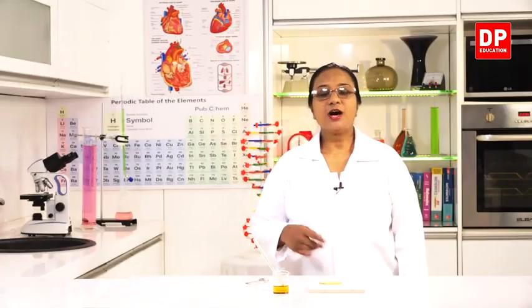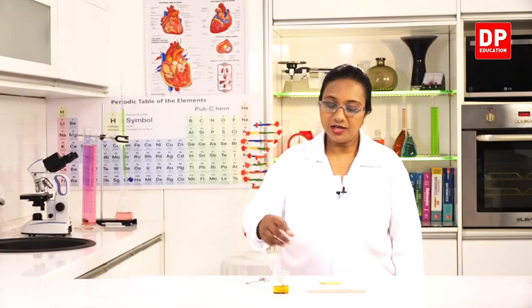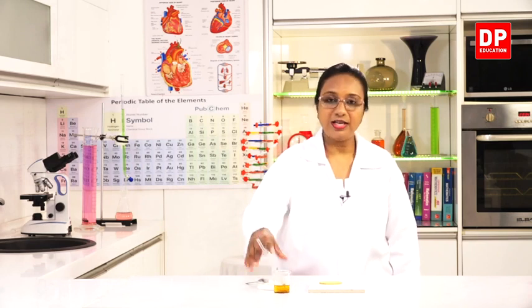Okay students, now we will do the activity to test for the presence of starch in biomolecules. As food samples, I have 3 samples here: a piece of string hopper made from flour, a piece of potato, and flour for starch. Now you all know we need to use one particular reagent, that is a solution of iodine, which is reddish brown in color. The procedure is to add few drops of iodine to the food sample and observe.